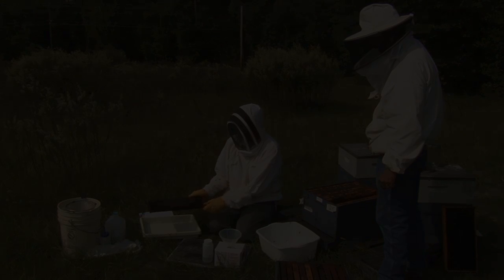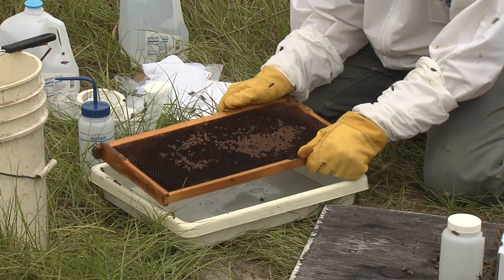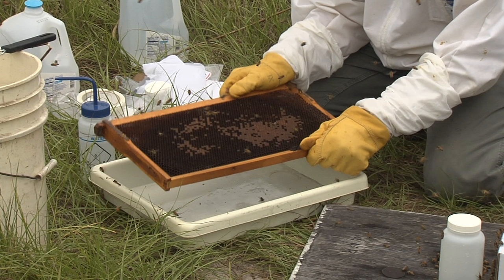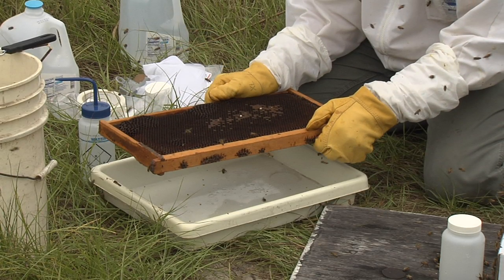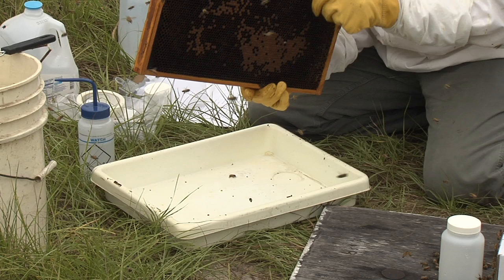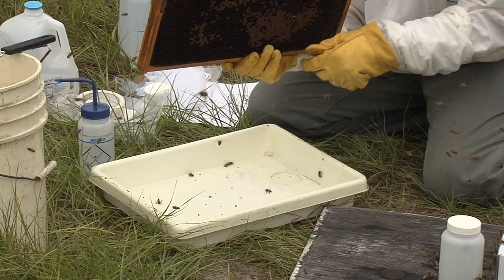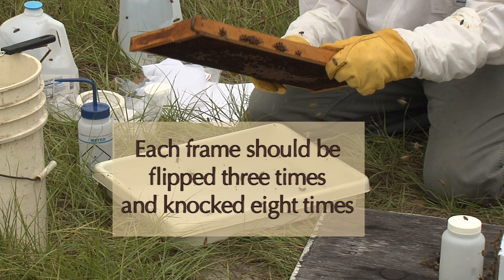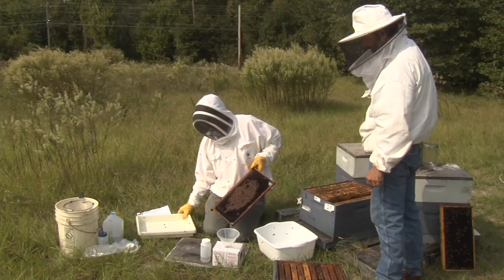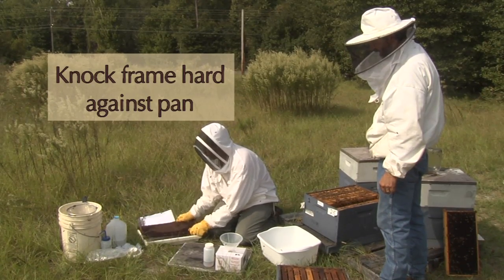Take the frame and hold it over the collection pan with one surface of the frame facing down. Firmly knock the outer edge of the frame twice against the pan to dislodge mites, beetles, and other hive debris from the frame into the collection pan. Turn the frame so the next frame surface is facing down and knock the frame twice. Repeat, turning the frame and knocking twice each time. Each frame should be turned three times so that the frame is knocked a total of eight times. Please hit the frame hard against the pan to knock off any potential mites.